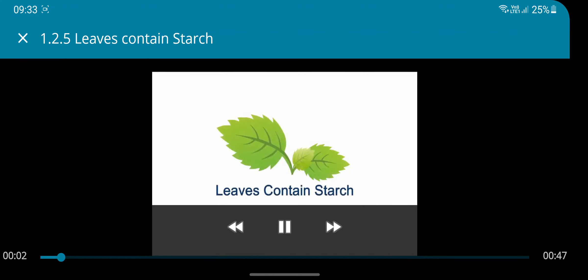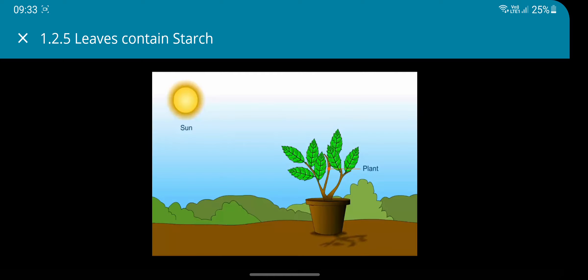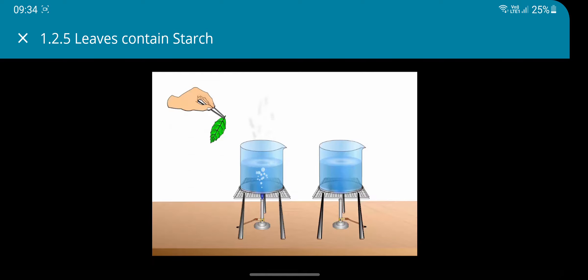Leaves contain starch. Take a leaf from a plant that has been exposed to sunlight for several hours. Chlorophyll, which gives the leaf its green color, has to be removed before testing for starch.